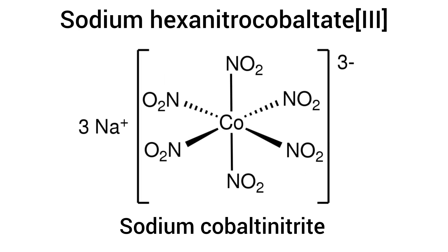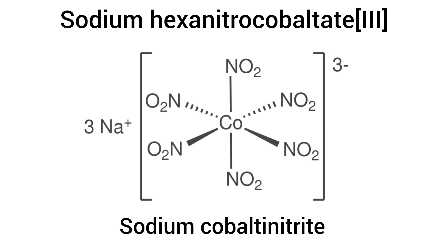In this video, I will be showing you the preparation of sodium hexanitrocobaltate 3, also known as sodium cobaltinitrite.